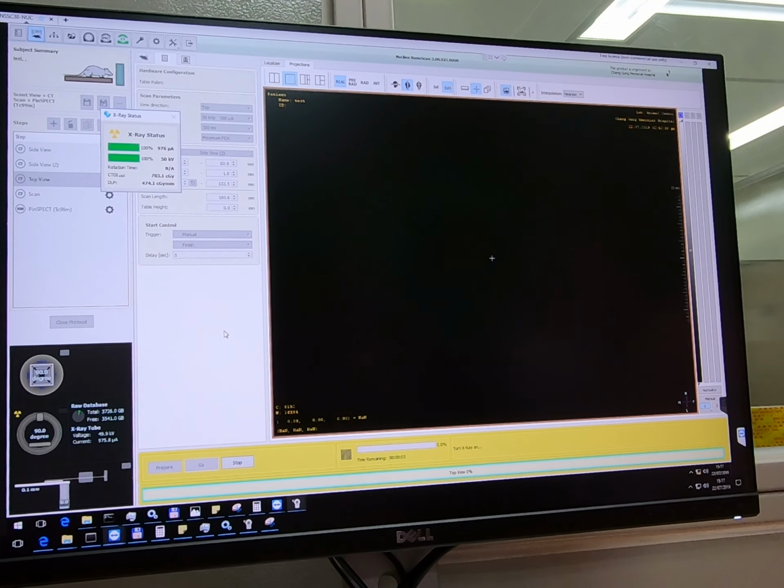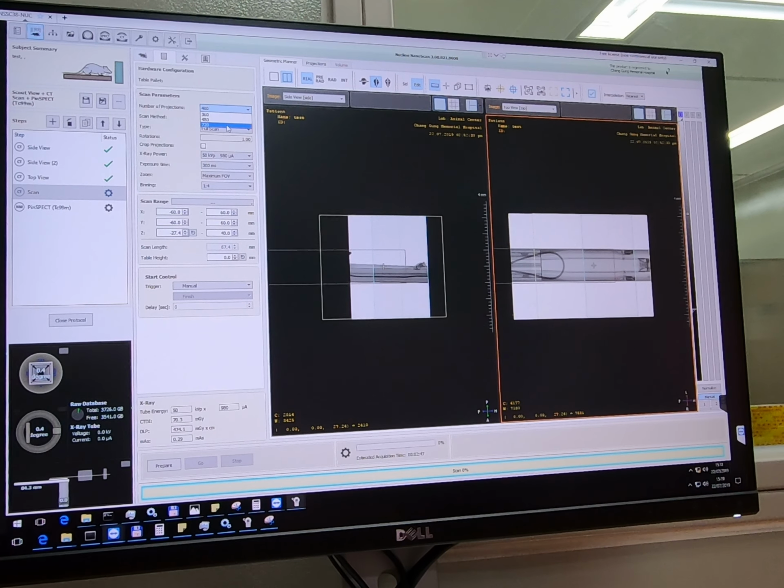No, actually, this is the highest on this default list, but because it's a flexible thing like the zoom motor position, for example. So actually, the highest, which is of course never used, but it's still possible. The higher projection number is mostly used for ex vivo samples.